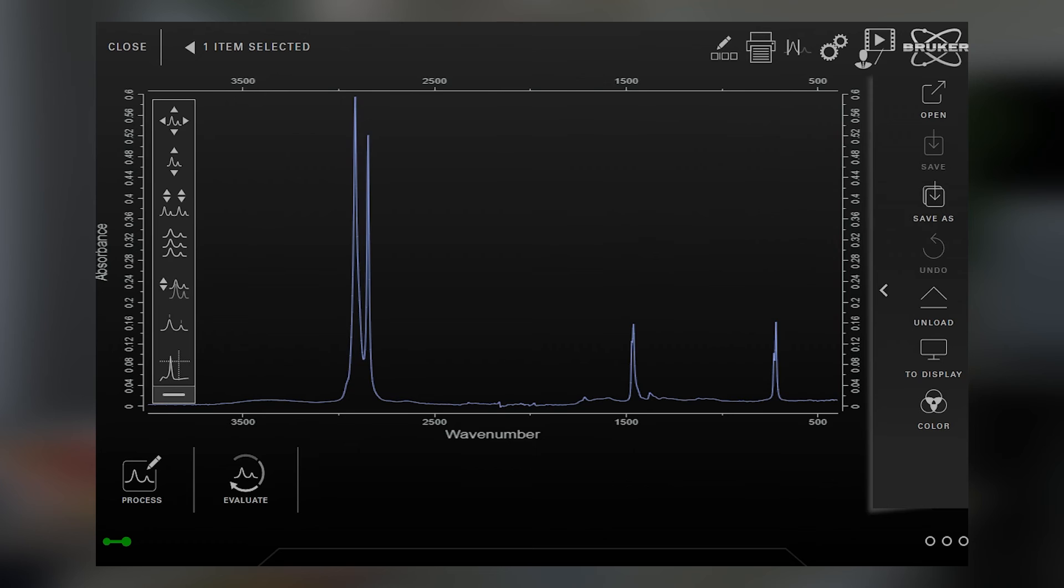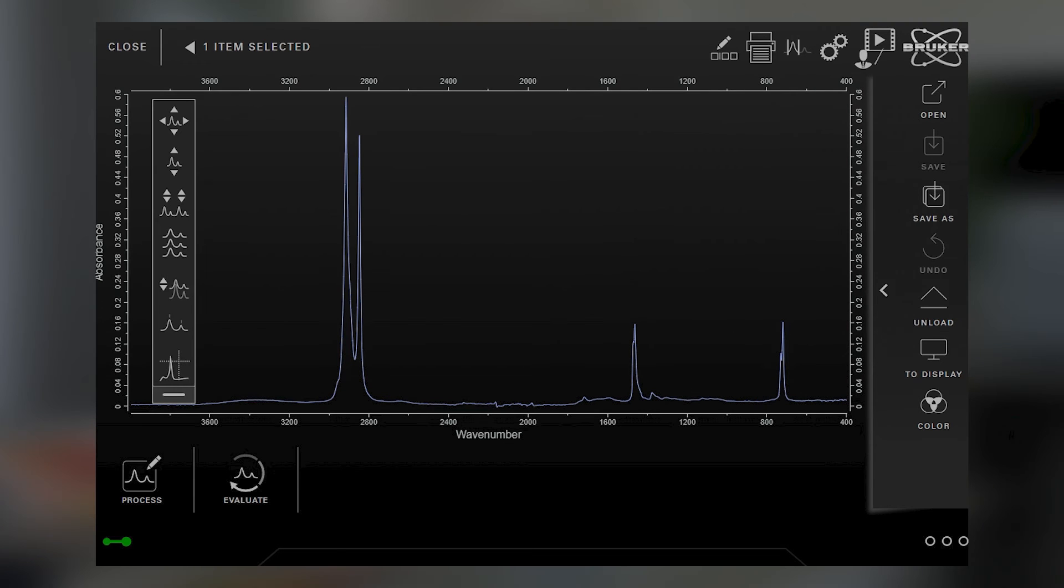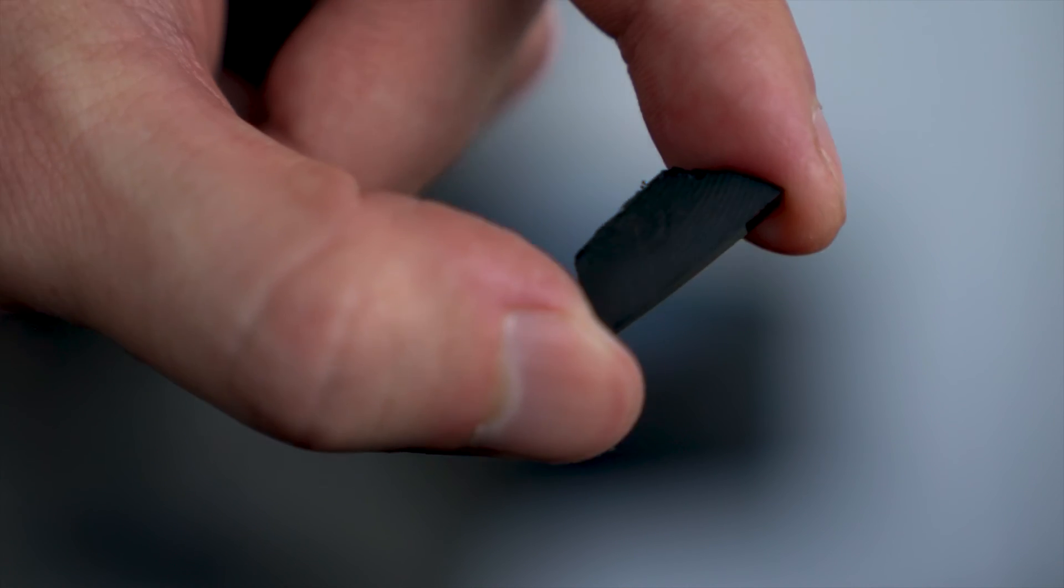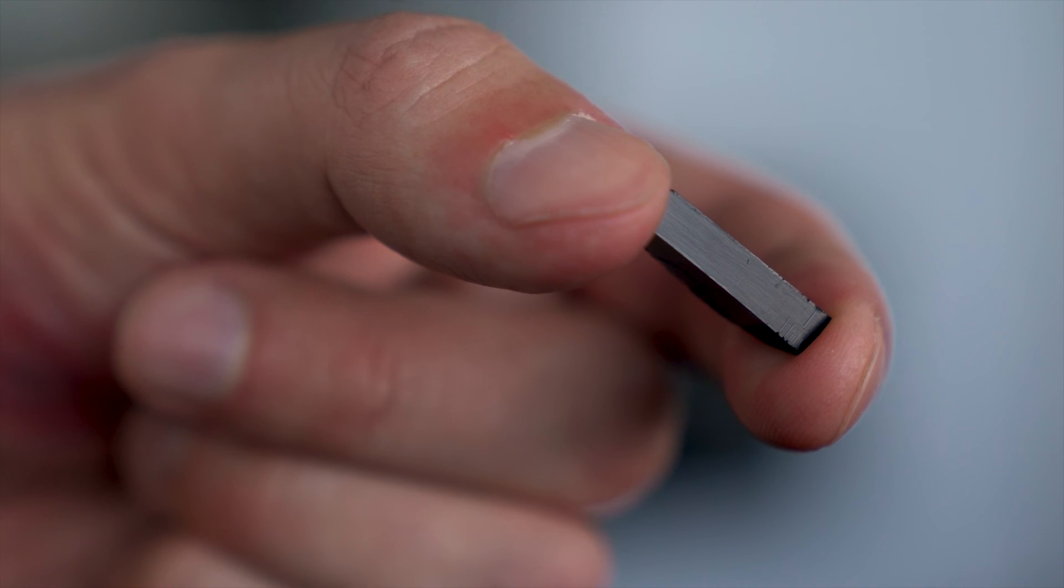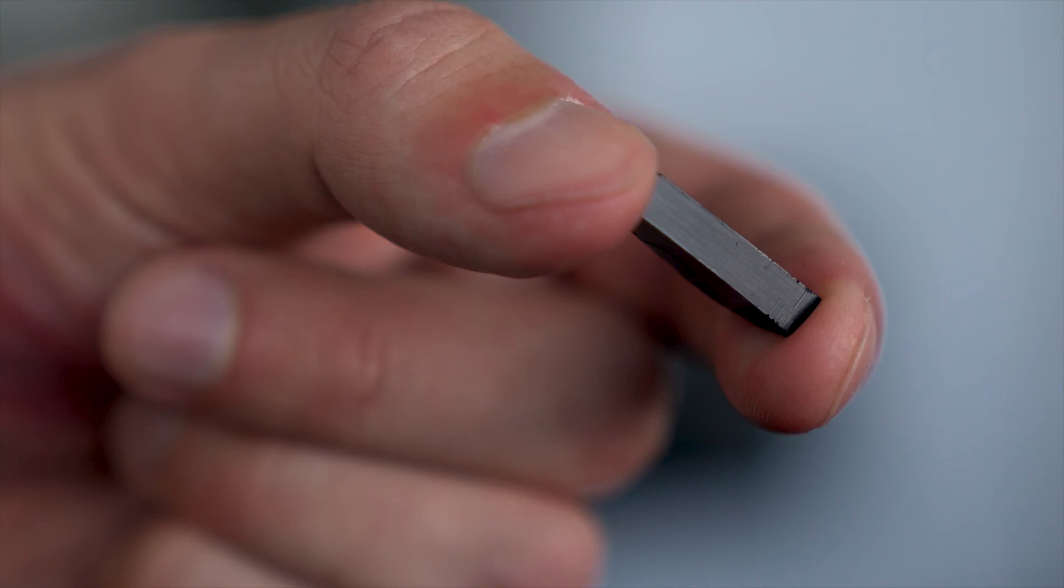With this information, we can now look for the root cause and optimize process parameters. Of course, this also works for microscopic samples and completely different plastics like PET or PVC.